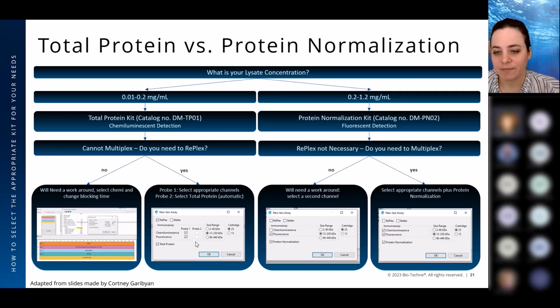So the software won't allow you to do that. It's just a default to reference capillary number 2. And the assumption here is that all your samples should be looking equivalent. So you don't want to put your negative sample in reference capillary 2. If that reference capillary 2 happens to be very low level, I would pick another reference capillary. But the algorithm of the software actually works out. However, if you want to normalize every sample to its capillary, you can easily take it out into Excel, copy and paste the data out and do it manually. Well, not manually, but use Excel.